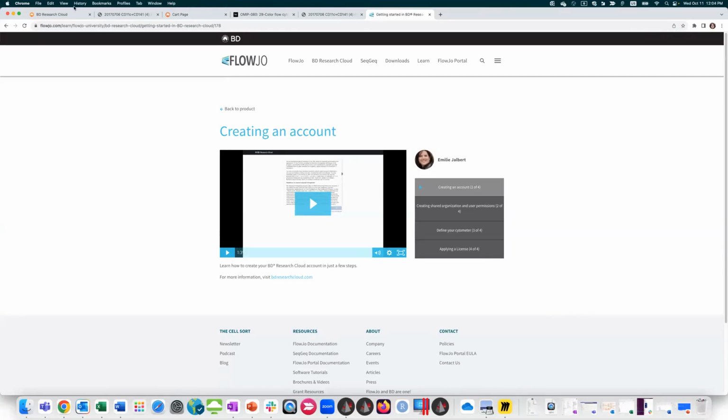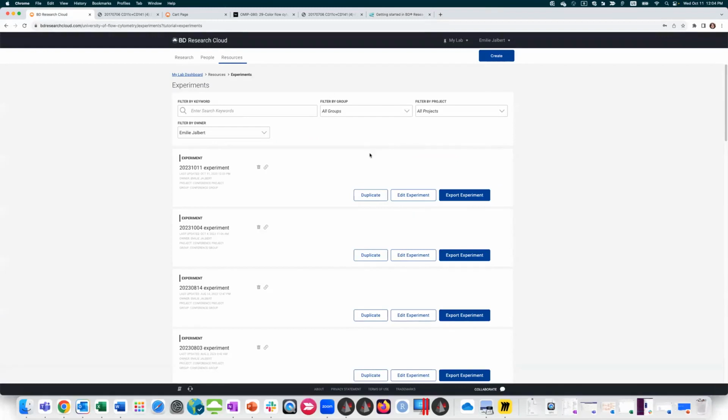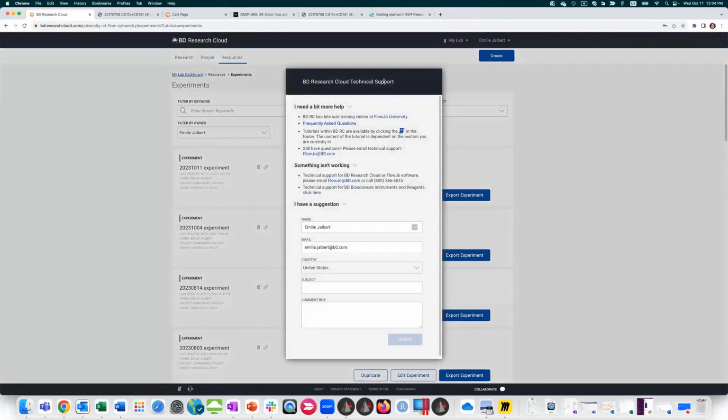And then lastly, back in BDRC, if you have a question here, there's a little tech support icon that you can click on. So BD Research Cloud Technical Support. If you need help, it shows you where those videos are, the FlowJo University. We have frequently asked questions. It reminds you that you can click tutorials at any time to get more information. I'll show that to you in just a bit.